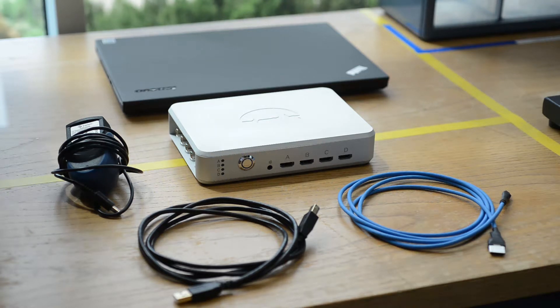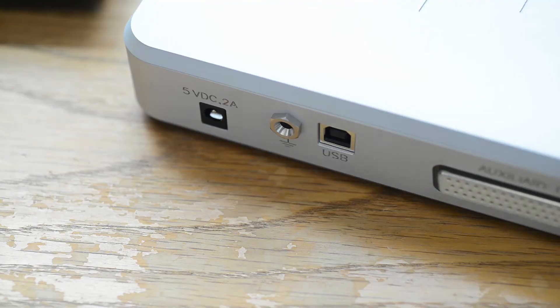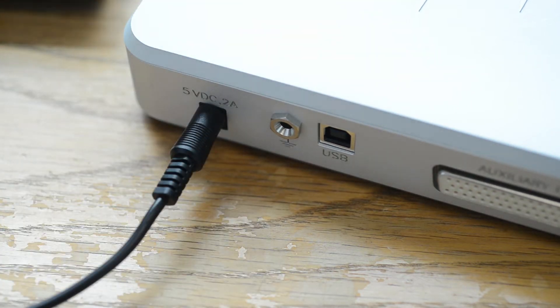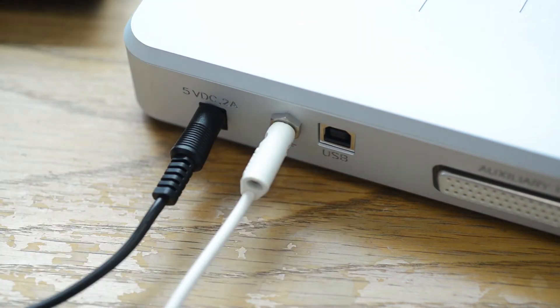This video will show you how to set up the smart box. First, connect the power brick, ground cable, and USB cables to the smart box. Do not turn it on yet.